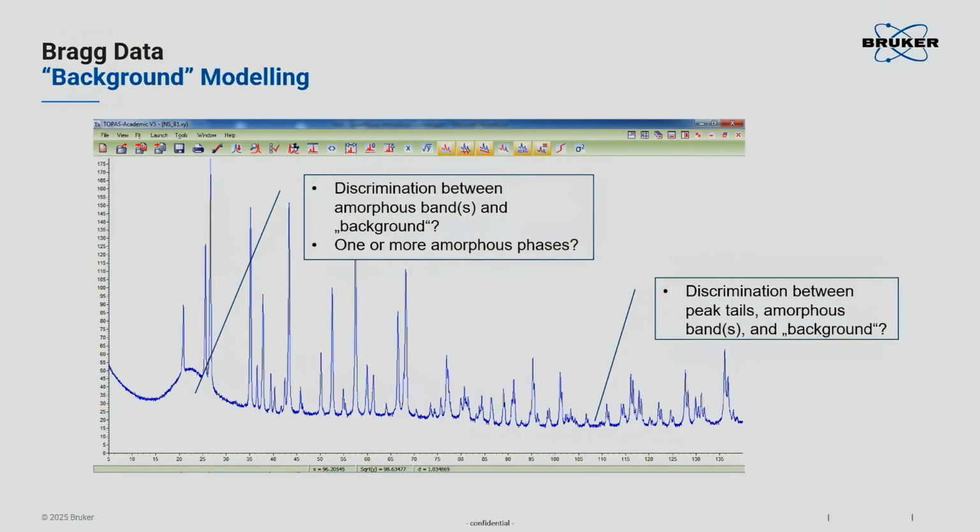Yes, sample fluorescence. No? In this particular case, there is no fluorescence, but it can contribute a lot. Now, fortunately, if your slit settings of your instruments are right, fluorescence is equally distributed in all directions. So normally it will only raise your background by a constant value. So that is something which could be dealt with.